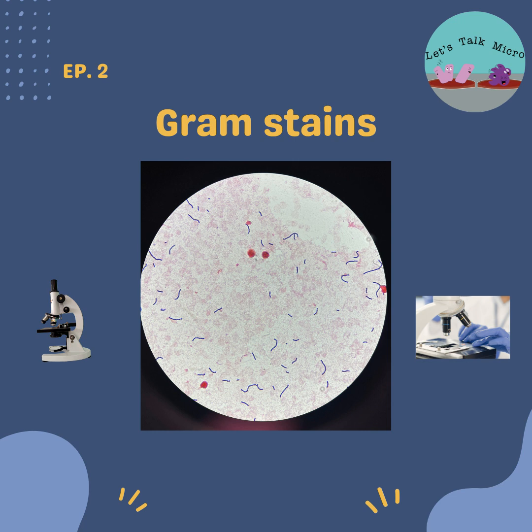Decolorizers, you have different kinds. Sometimes labs make their own. There was a facility that I worked at that used to make a stronger one, and it was intended for blood cultures. Those of you working in the field or maybe doing your clinicals right now, of course, when you put that blood on a slide, it's very thick. So a good strong decolorizer helps you make sure that you properly decolorize your slide. Some techs say that it is too strong, but in my case, I liked it just fine.